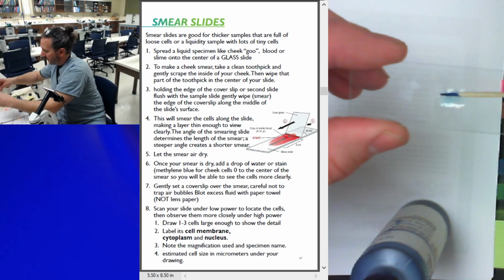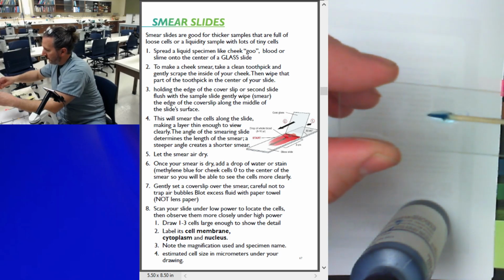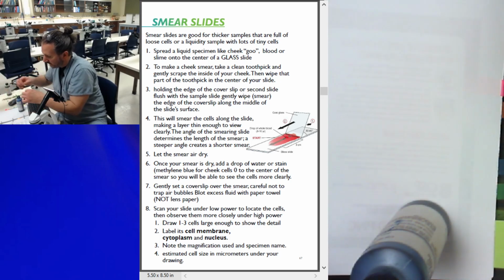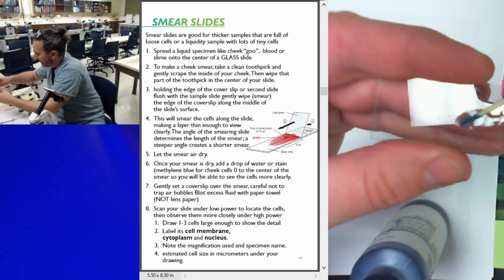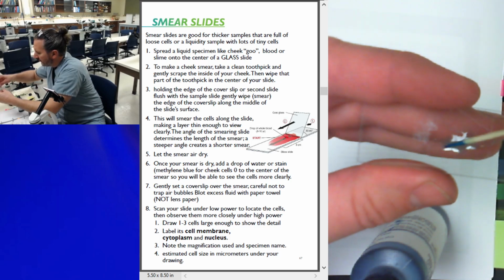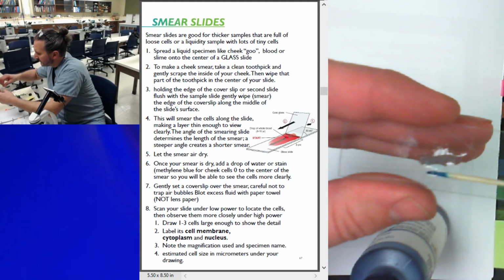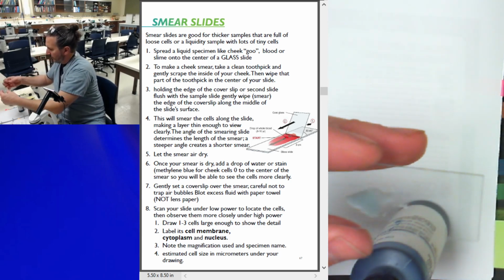I'm going to take the toothpick and I'm going to smash up that little piece of plaque, tartar. Did I get it? Keep smashing. I'm going to put my finger over so you can see. I just got my fingerprints on the bottom, so I'll wipe that off too. Little piece. Pretty aggressive. Okay, I feel like you use a little bit more blue.